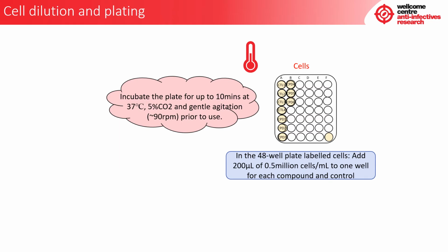Next, incubate the plate for up to 10 minutes at 37 degrees Celsius, 5% CO2 and gentle agitation, approximately 90 rpm, prior to use.